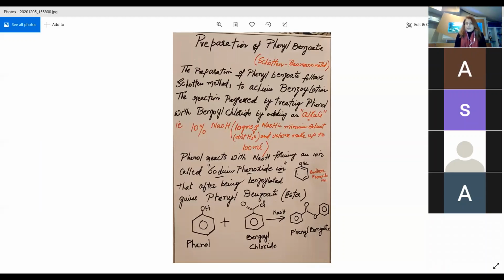Okay, so come to the point. This is the preparation of phenyl benzoate, and it's a diagrammatic pathway. Now here, these are my horrible drawings, but I hope you are not familiar with my drawings. So this is a 250 ml conical flask, right? You have to put aside a 250 ml flask, clean, dry, and washed, right?